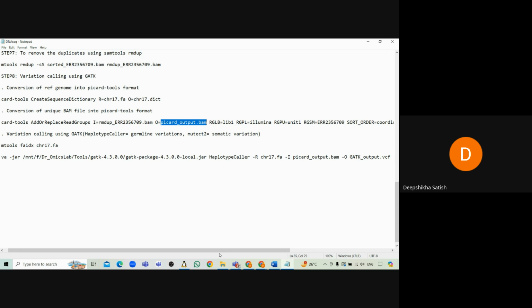In simple words, the haplotype caller algorithm identifies genetic variations like SNPs and indels by assembling the short DNA sequences, called reads, into a longer or more complete sequence. Then it considers different possible sequences, which we call haplotypes, calculates the likelihood of each, and determines which variations are present in the sample.